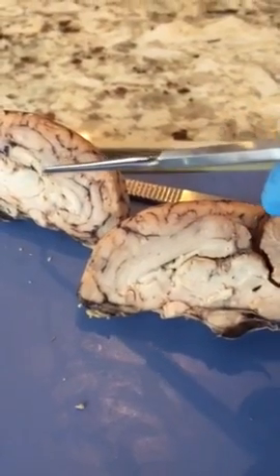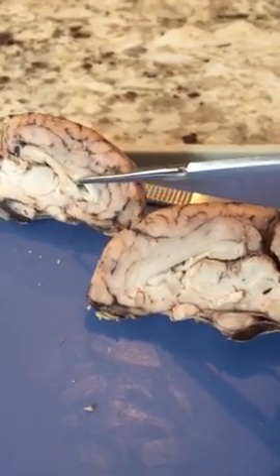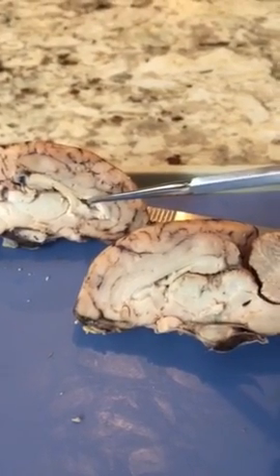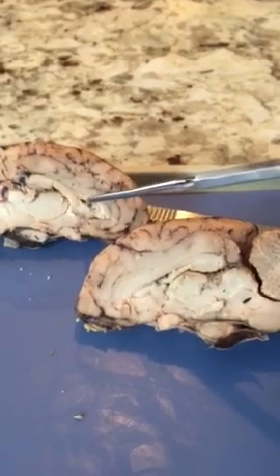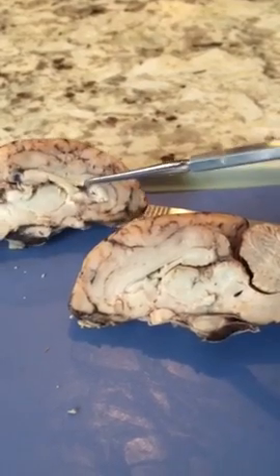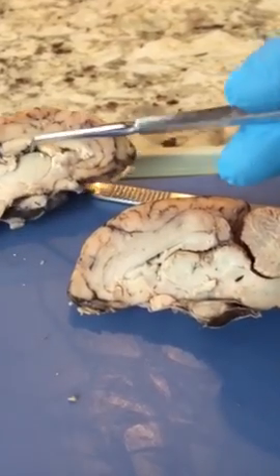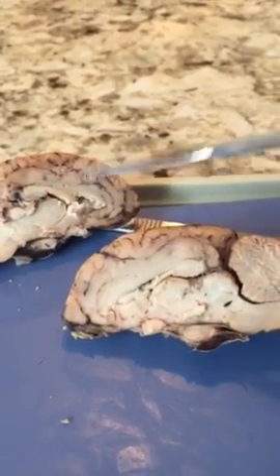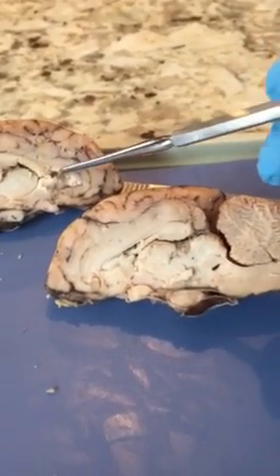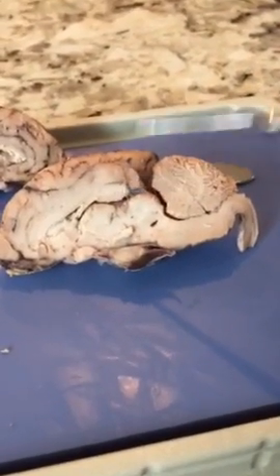The lateral ventricle is the area inside here, and the septum pellucidum is this thin membrane that I just separated. The choroid plexus is the dark matter inside here. The third ventricle is this ventricle right in here.